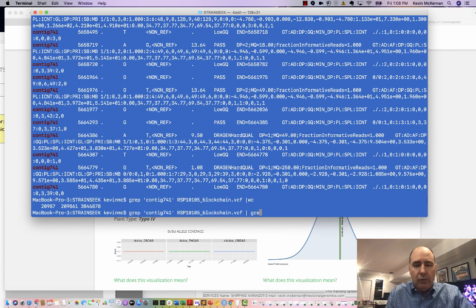Let's pipe this to grep again, and let's look for only ones that are near THC synthase. And I happen to know it's 441. That'll get us close, that's in the ballpark. Okay, that's going to give us everything that matches 741, then pump it into, I want everything that's got 741 and 4417. 4417 is a coordinate that's the beginning of the THC gene.